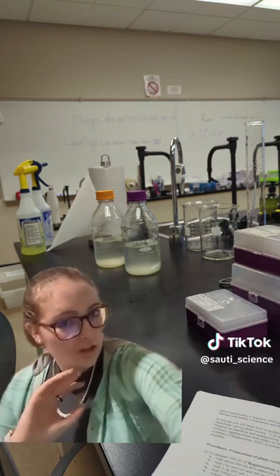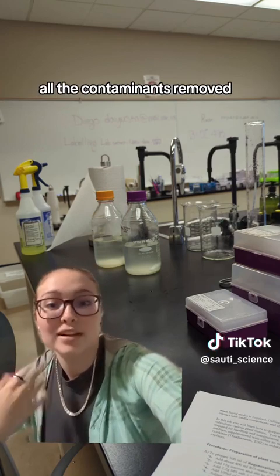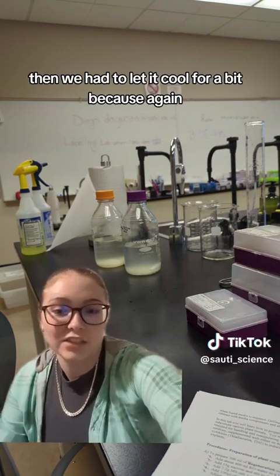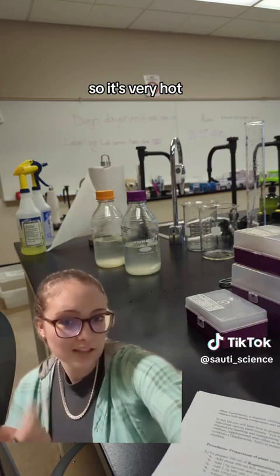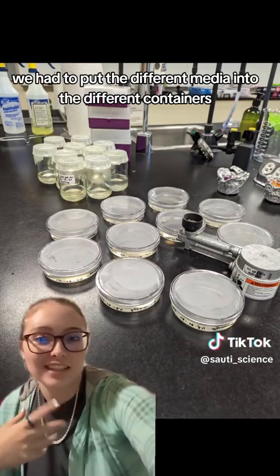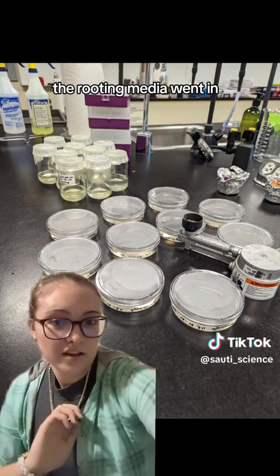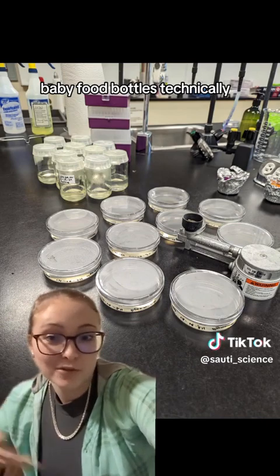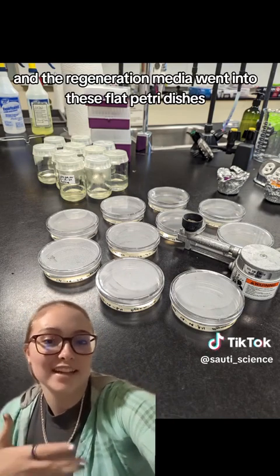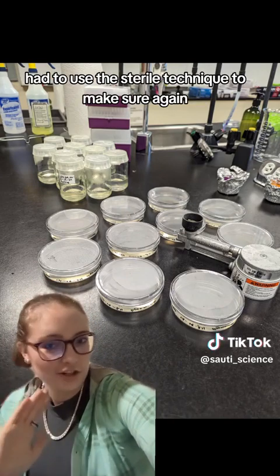We don't want fungus or bacteria to grow there — we want plants to grow there. After getting everything autoclaved and all the contaminants removed, we had to let it cool for a bit because it's very high temperature. Then we put the different media into different containers: the rooting media went into baby food bottles, and the regeneration media went into flat Petri dishes.